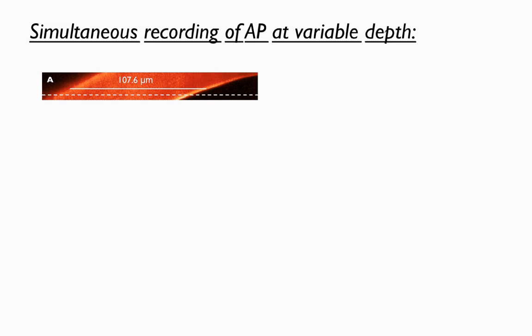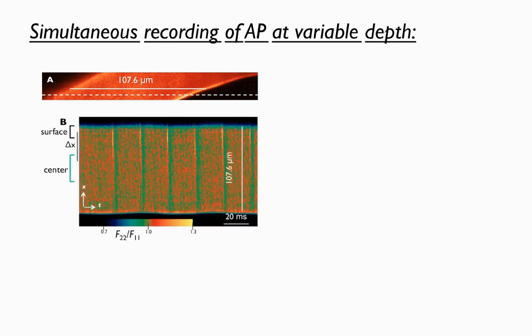In A, we show an X-Y image of the di-8-ANEPPS stained cell. In B, we can see the line scan of X-T. This image is obtained by repeatedly and rapidly imaging fluorescence along the dashed line in A. The two signals, F11 and F22, are obtained essentially simultaneously, and what is shown in B is already the ratio F22 over F11.